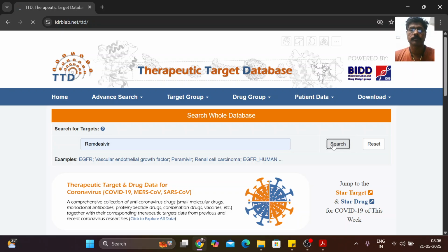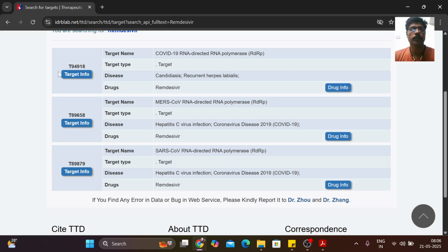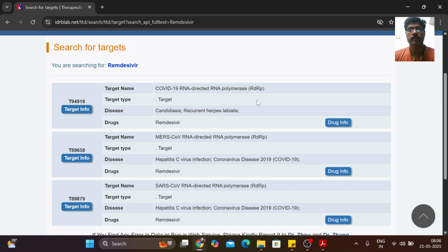I will search here and see that if you want more information about this target, you can click here. In this practical I need only the name of the target, right? So I can copy the name.